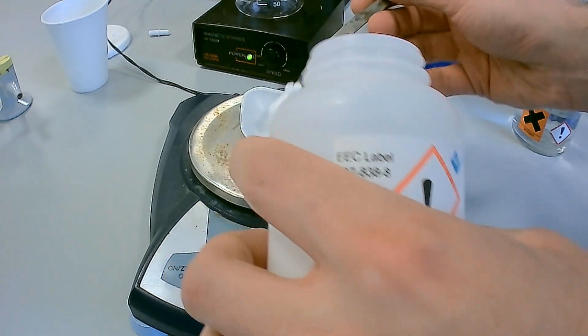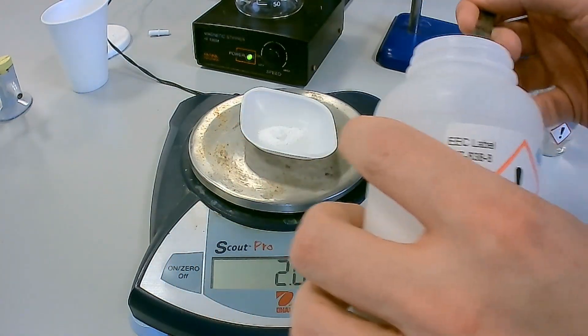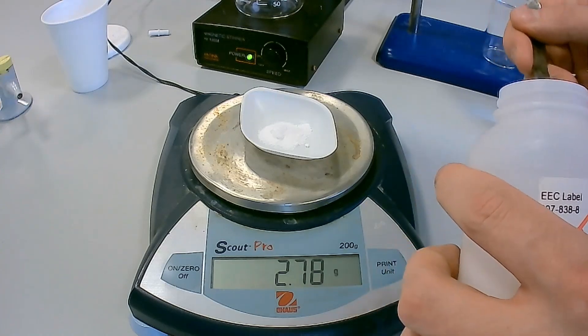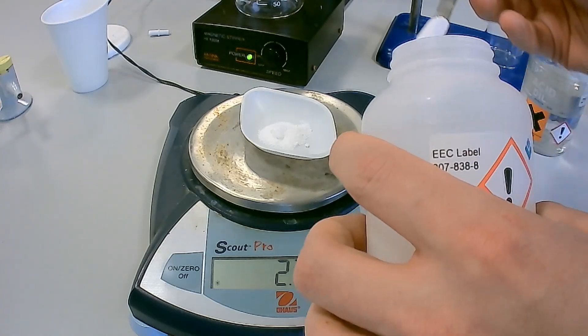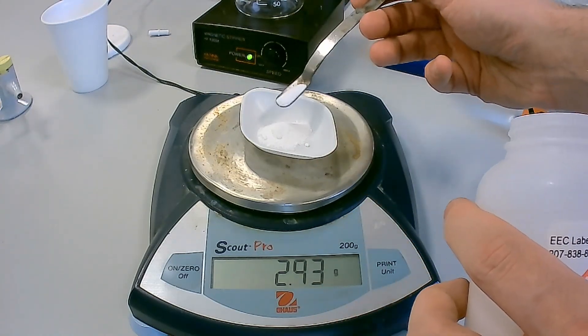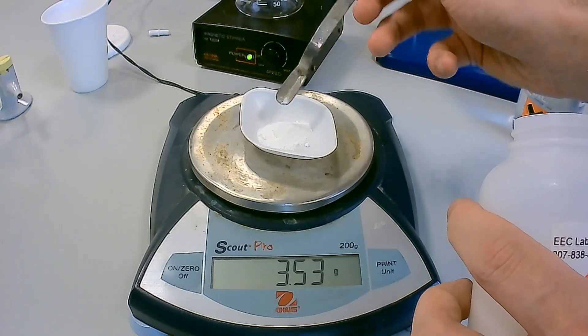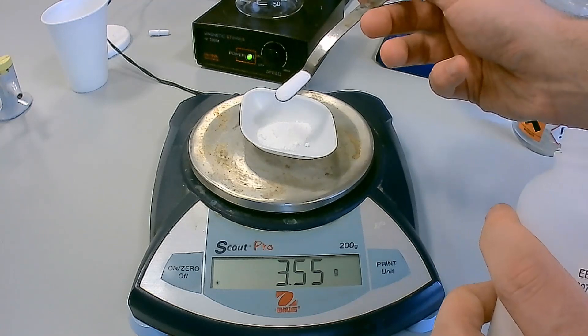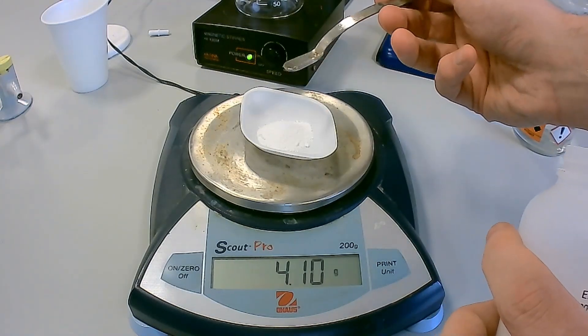First, place a clean weighing boat on a zeroed balance. Record the initial mass of the weighing boat in a suitable results table. Using a spatula, transfer between 2.5 to 3 grams of anhydrous sodium carbonate to the weighing boat. Record the mass of the weighing boat and anhydrous sodium carbonate in the same results table.